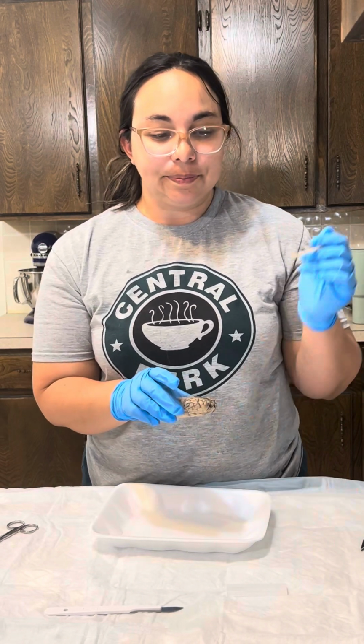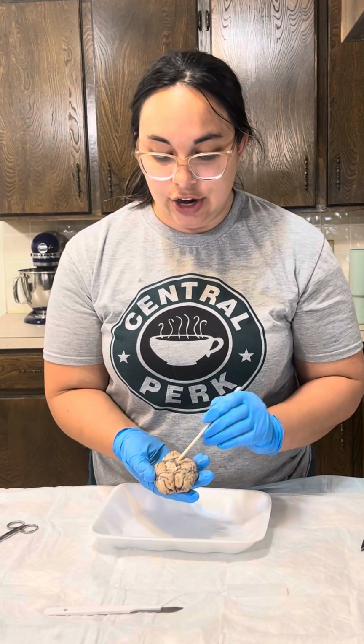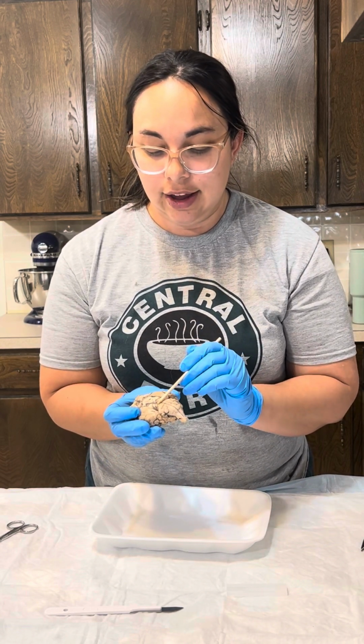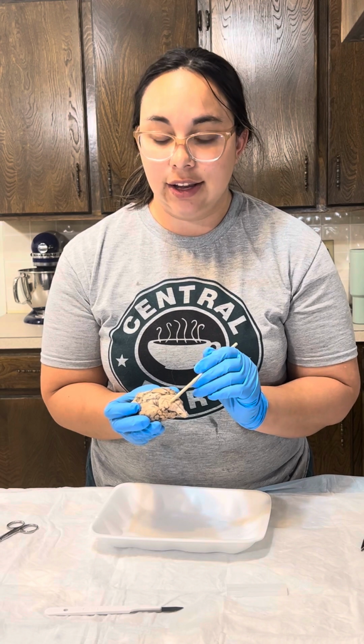I don't know if you can see that. It's actually called the optic chiasm. And so these are the olfactory bulbs. And then you can kind of see the brainstem here. So there's the pons right here, and the medulla oblongata, and then the brainstem.